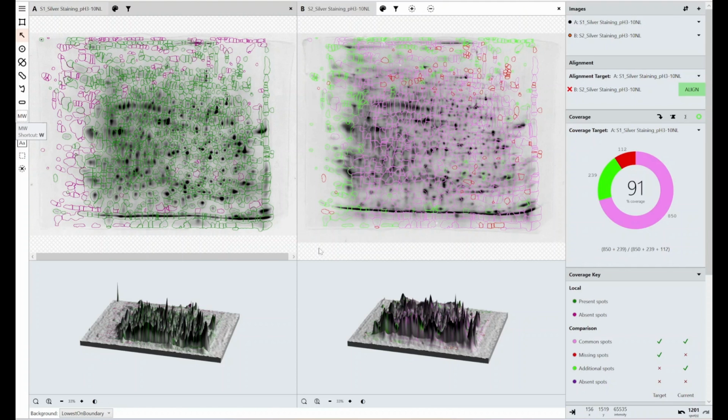This gets even more difficult depending on the databases that you're using for identification. If you're using a novel cell line, something like an insect cell line to develop vaccines, the libraries that people use to compare their results to are often incomplete and haven't been validated, and there's a lot of evidence out there to show that depending on what kind of machine you use and what kind of library you compare your results to, you can get vastly different results for your host cell protein identification.